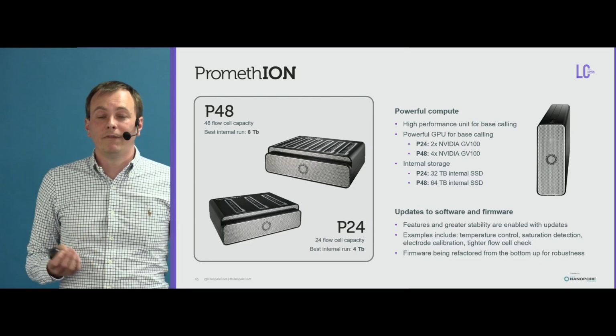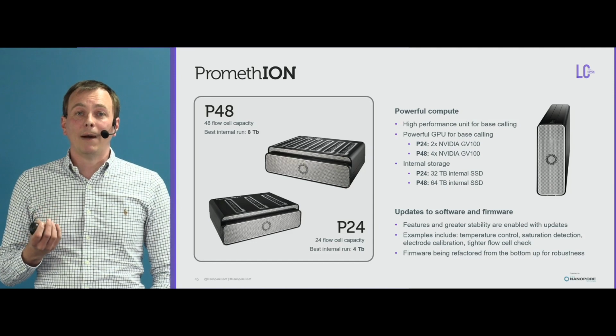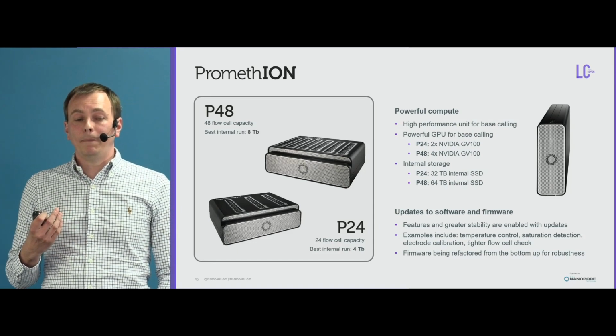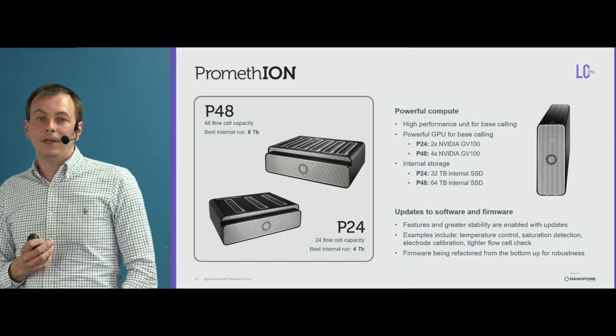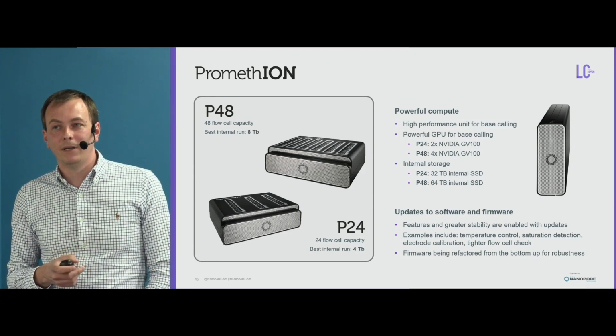The latest software and firmware updates allow you to get a better representation of how many good channels you've got. So all of these things we work on do have small incremental improvements to the sequencing, so please do make sure that you keep your software and firmware updated.